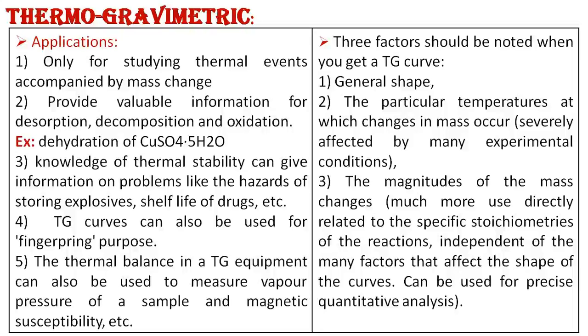The magnitude of the mass change is directly related to the specific stoichiometry of the reaction, independent of the many factors that affect the shape of the curves, and can be used for precise quantitative analysis.